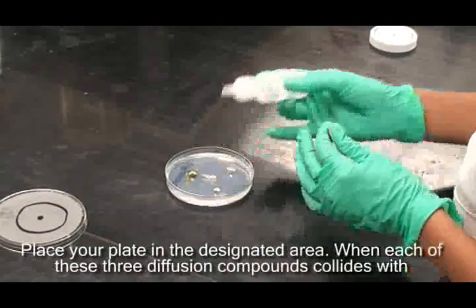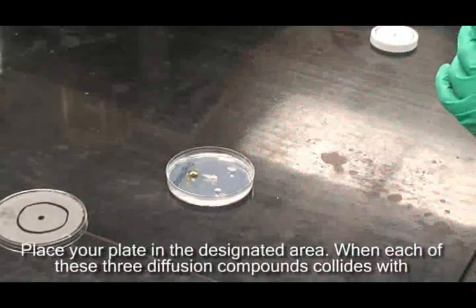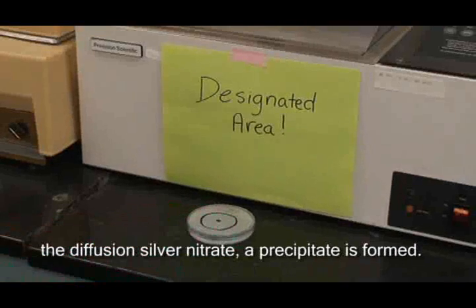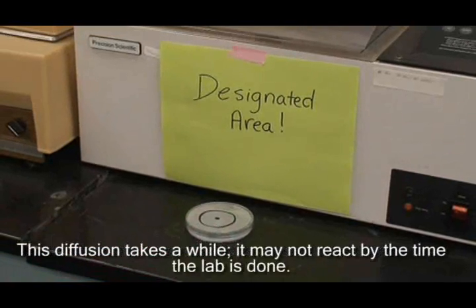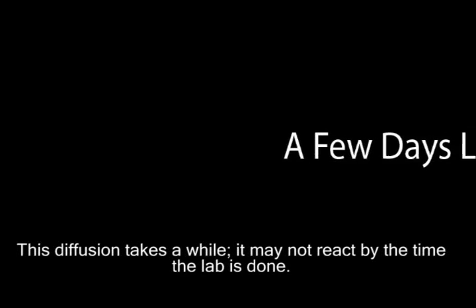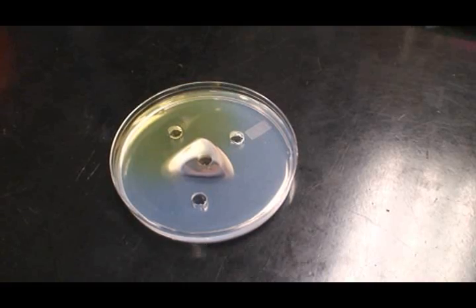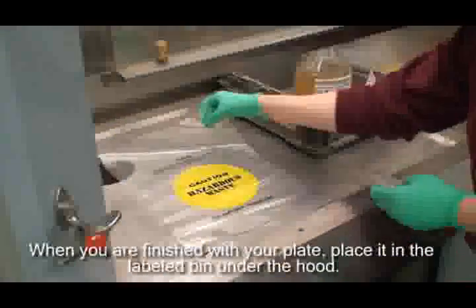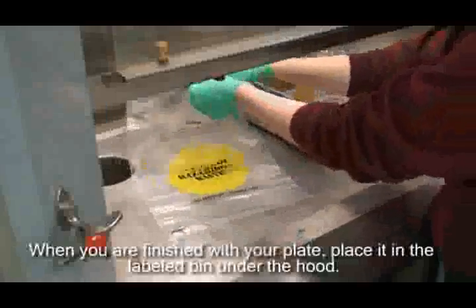Place your plate in the designated area. When each of these 3 diffusion compounds collides with the diffusing silver nitrate, a precipitate is formed. This diffusion takes a while — it may not react by the time the lab is done. If this is the case, come back and check it over the next few days. When you are finished with your plate, place it in the labeled bin under the hood.